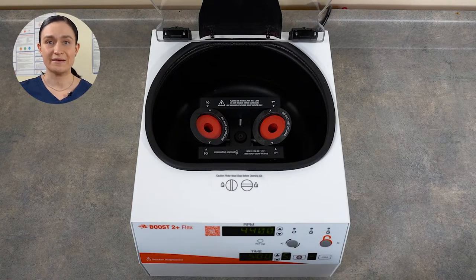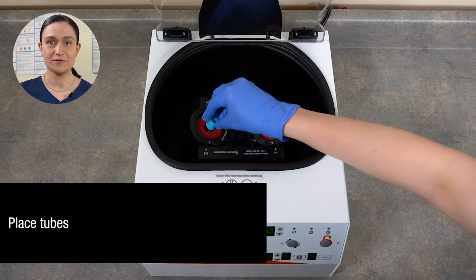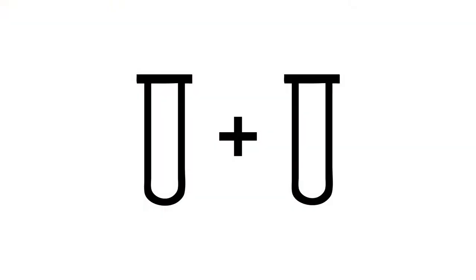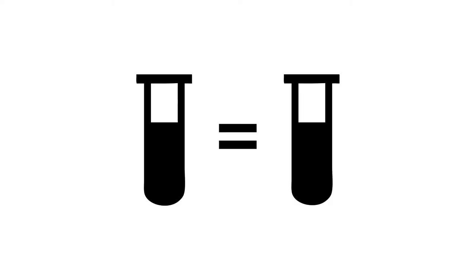Step three: place your sample. It should be securely seated within the insert or bucket, but should not snap or click into place. If only spinning one sample, you'll need a counterbalance in the other bucket. This should be an identical tube filled with an equivalent volume of water. The counterbalance should be roughly the same weight as your filled tube.